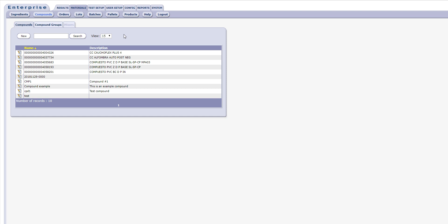The Compound Management screen allows you to manage not only compounds but also compound groups. You may add, edit, or delete compounds and associate a compound with a compound group or specification.